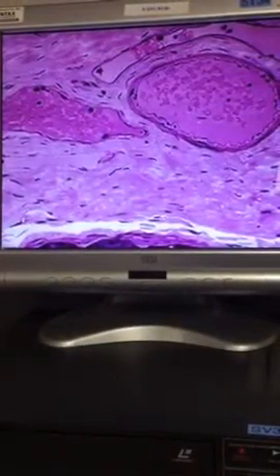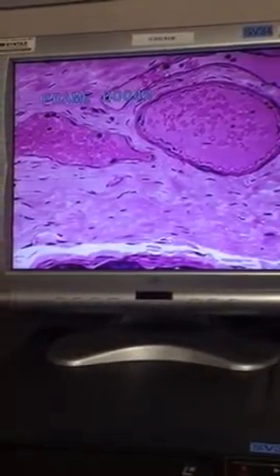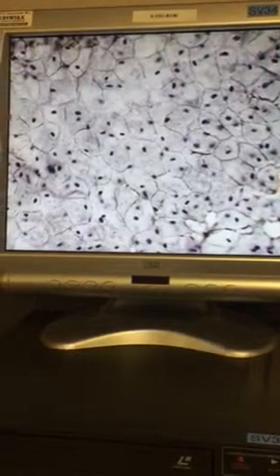Okay, so I just want to show you what this would look like if we were looking at a serous membrane. Remember we said that simple squamous is also found in our serous membranes. So this is what's called a surface view, like we're looking down at a sheet of simple squamous epithelium. It looks to me like a bunch of fried eggs in a pan, but you will be seeing this from the side. Okay, so I just want to show you the same tissue from the side.